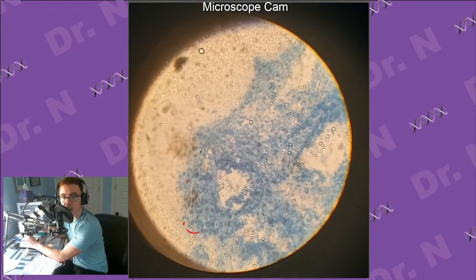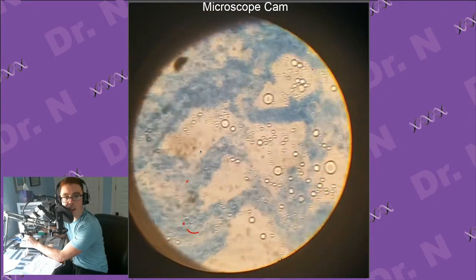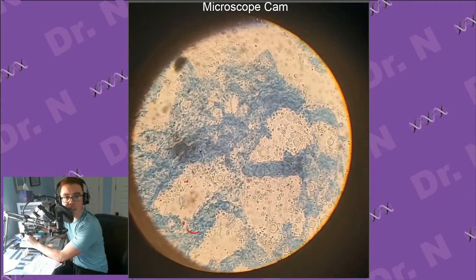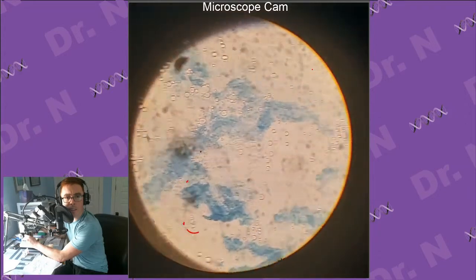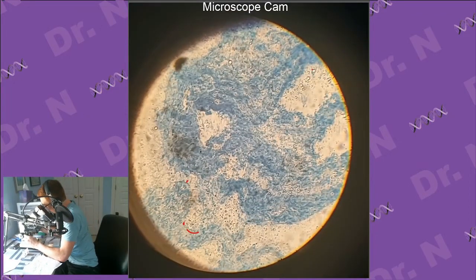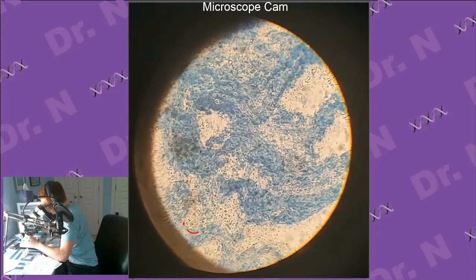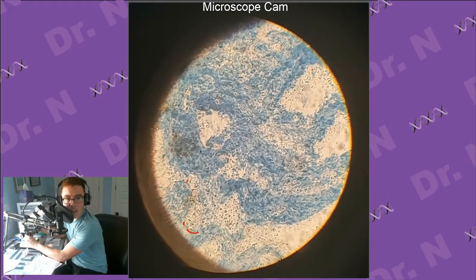Also, my microscope is way dirtier than I thought it was after seeing this. You can kind of see whatever is on the actual lenses is showing up really strongly here. Yeah, okay. I just gotta look in the eyepiece really quick after I center it. Yeah, so I think this is just some random staining. It's nothing really all that exciting.